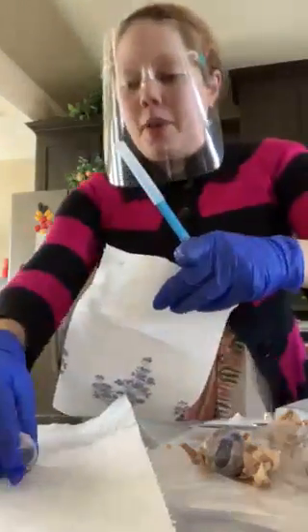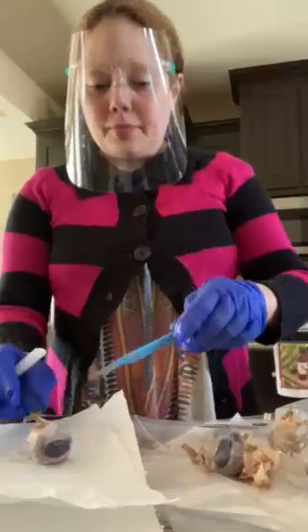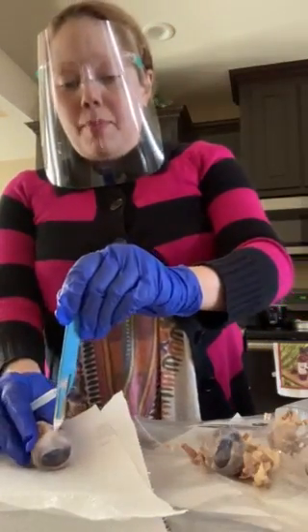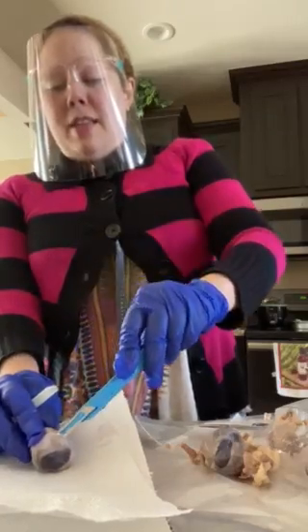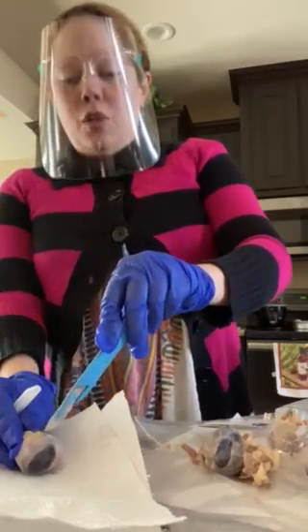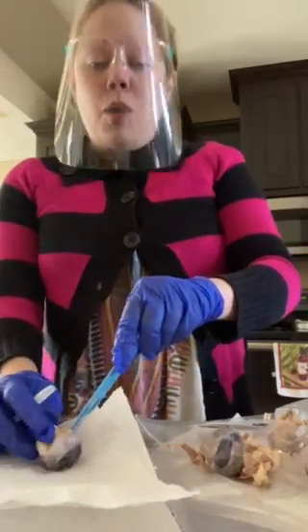I put some paper here because this one will have liquid. I will make a puncture here. And actually, you will see some of the aqueous humor coming out.